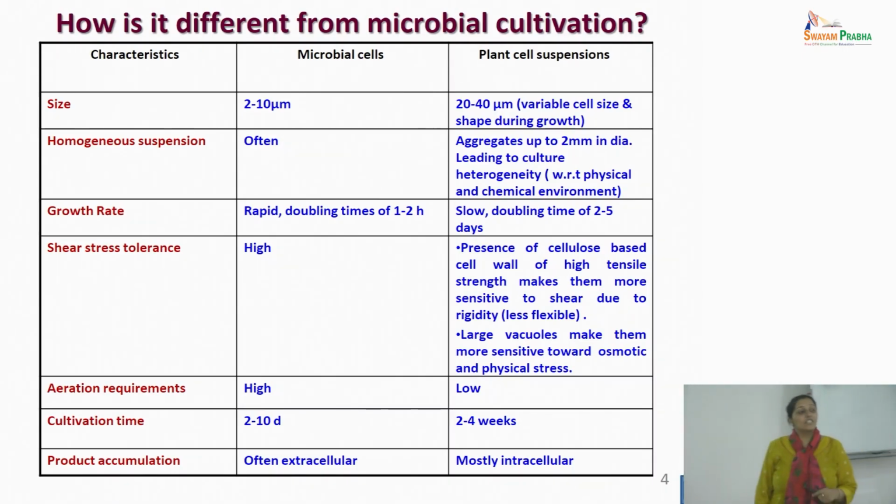So what implication will it have on your choice of reactor design? You will have to look into long drawn fermentation and sterility maintenance. Although on paper in a lab, you may say that a complicated design seems to be working well, let's say a photobioreactor with high aspect ratios, where you have made all sorts of changes in the geometrical design to improve your mass transfer, always keep scalability in mind.